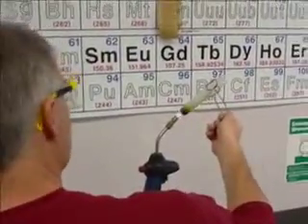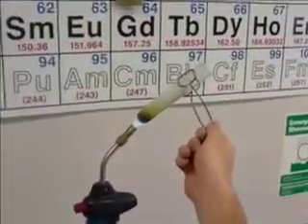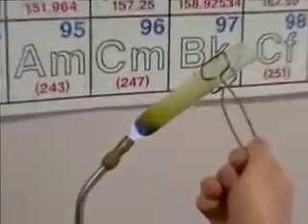And if you look carefully, you can see that the sulfur slightly melts there, Mr. Sams. I'm trying to zoom it in here without getting too close.